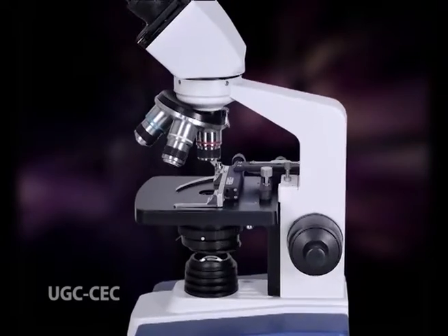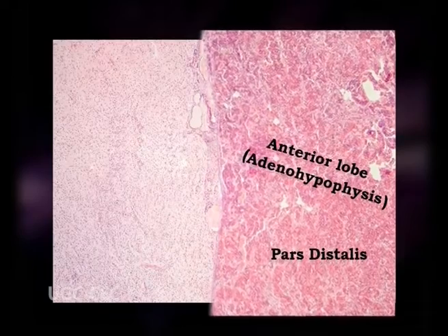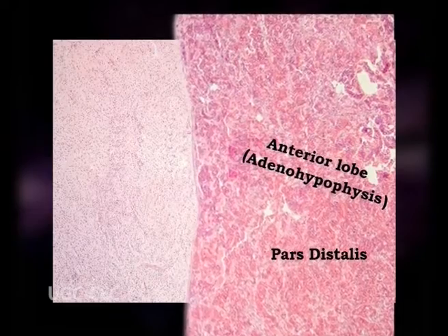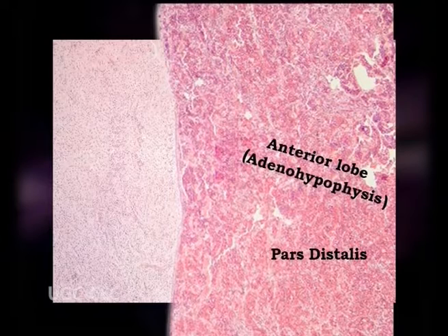At the microscopic level, the pars distalis of the anterior lobe of the pituitary contains bundles and cords of epithelial glandular cells which are polygonal in shape. Among these clumps, walls of highly vascularized connective tissue are present. Using hematoxylin eosin stain, these cells can be differentiated into two main groups. First is chromophil, those cells which are colored with this stain technique.